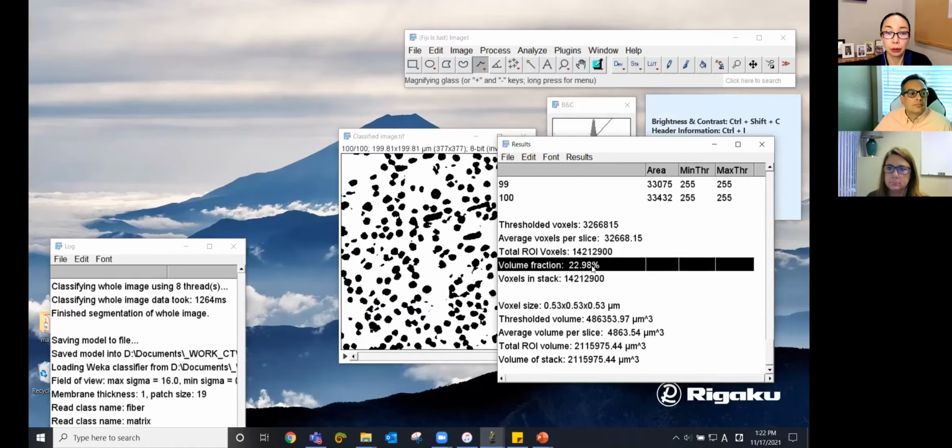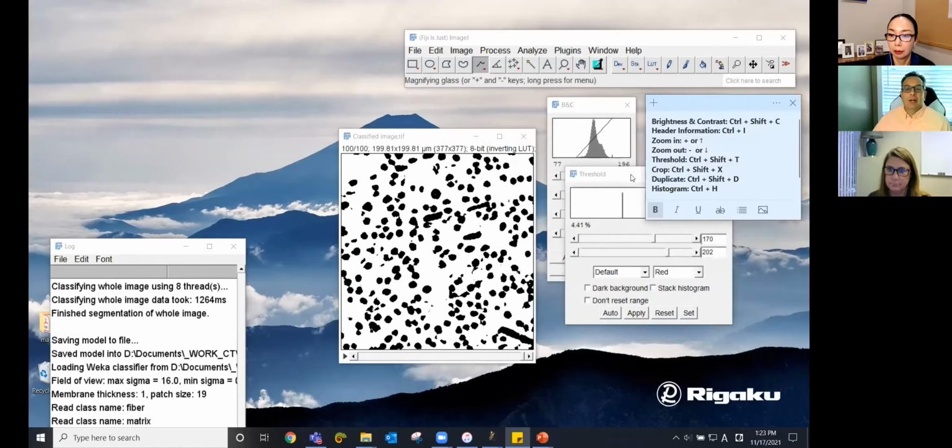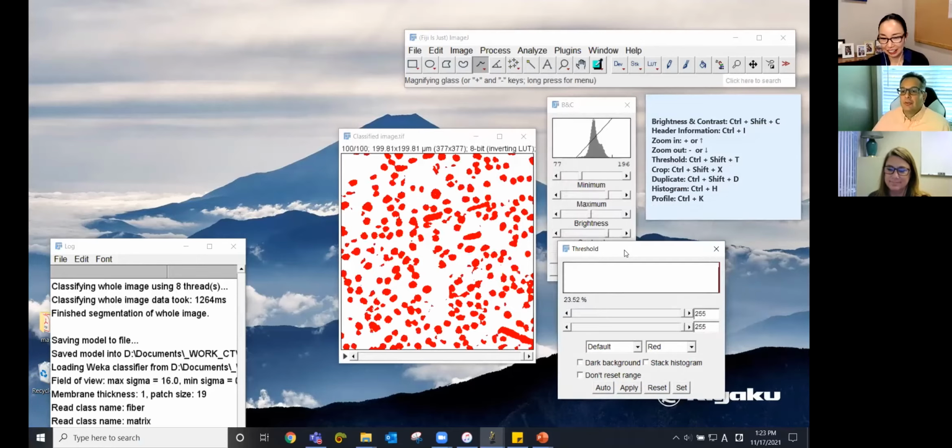Now, before we move on to the next image, let's see if we have any questions. We did get a couple of questions, Aya. One of them, I'll let you answer. I answered already, but I'll let you mention it as well. So you have those shortcuts on your little sticky tab there. You just created those yourself, right? That's not something that pops up from the software. No, I created it. Right? Yes.